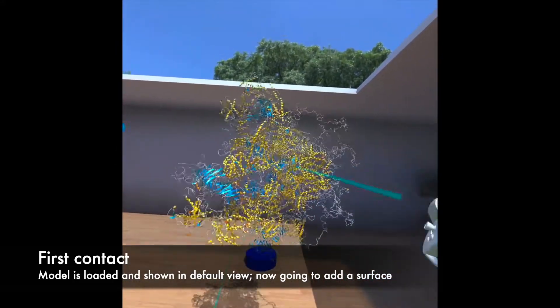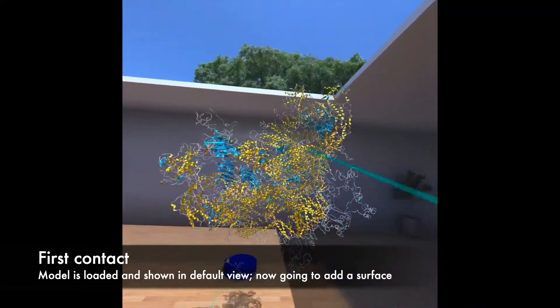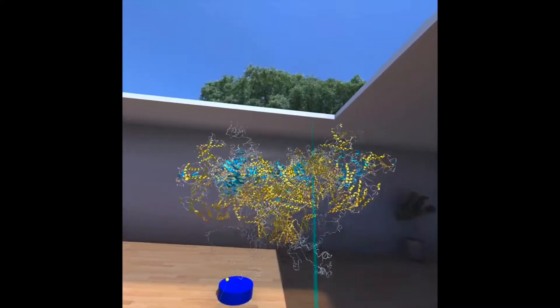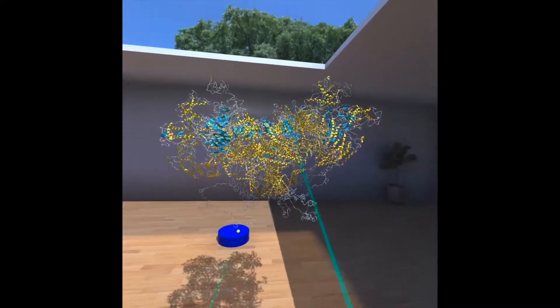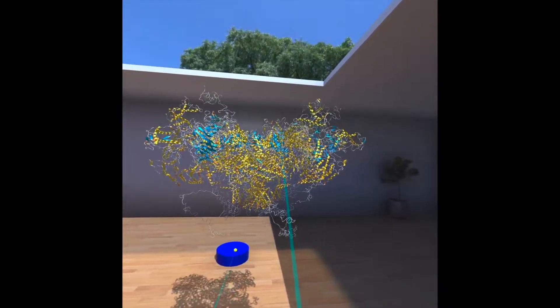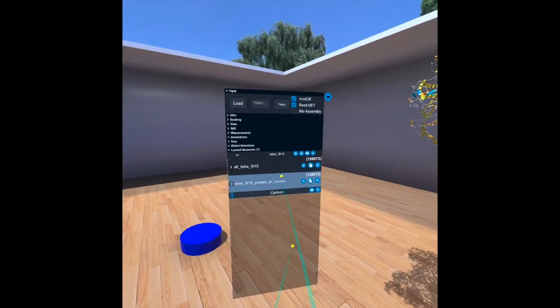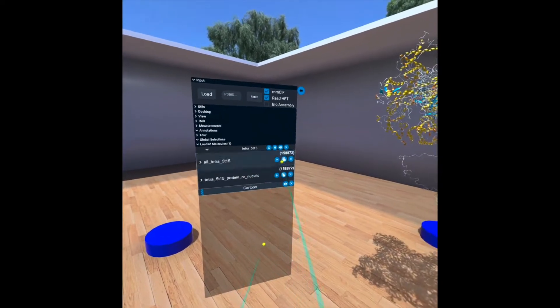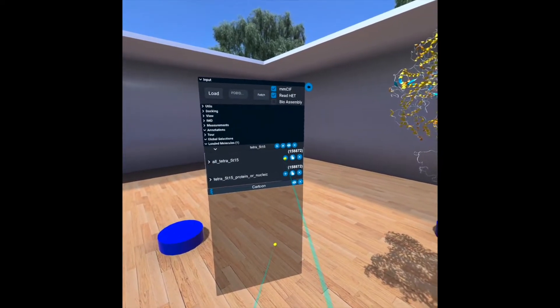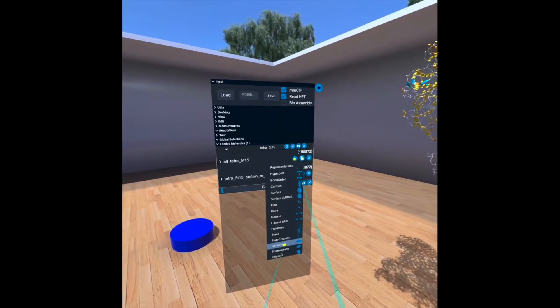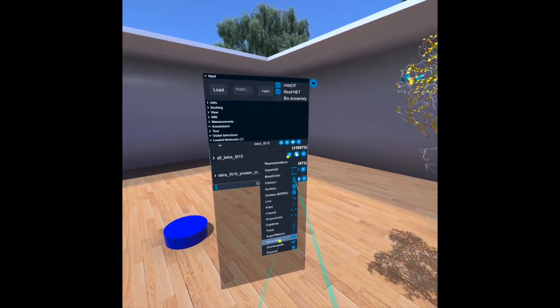Here we can see a nice molecular structure. Let us add a surface that will take a little bit of time.